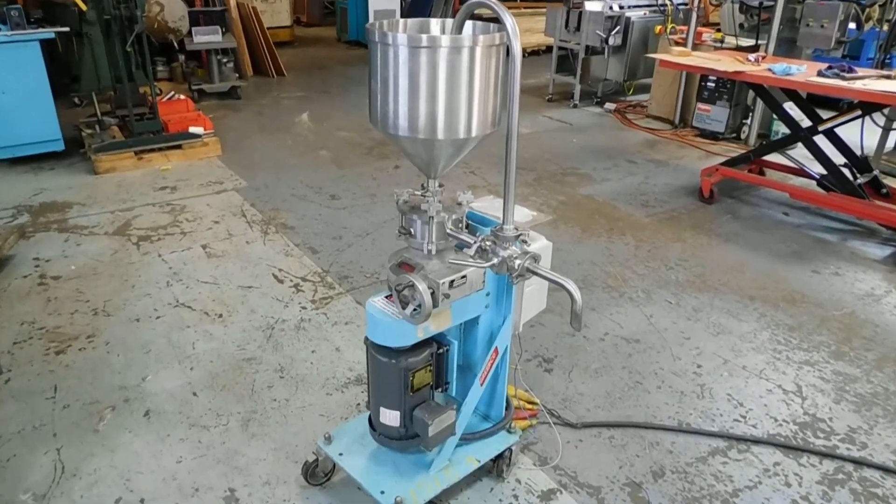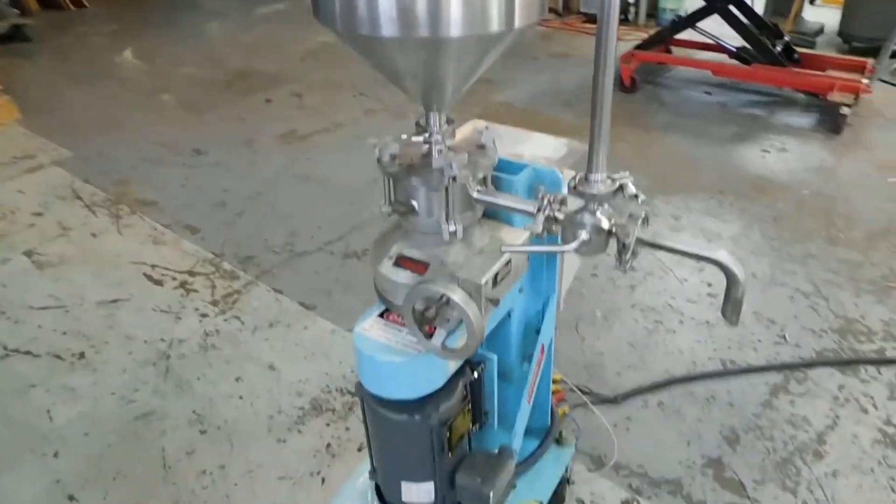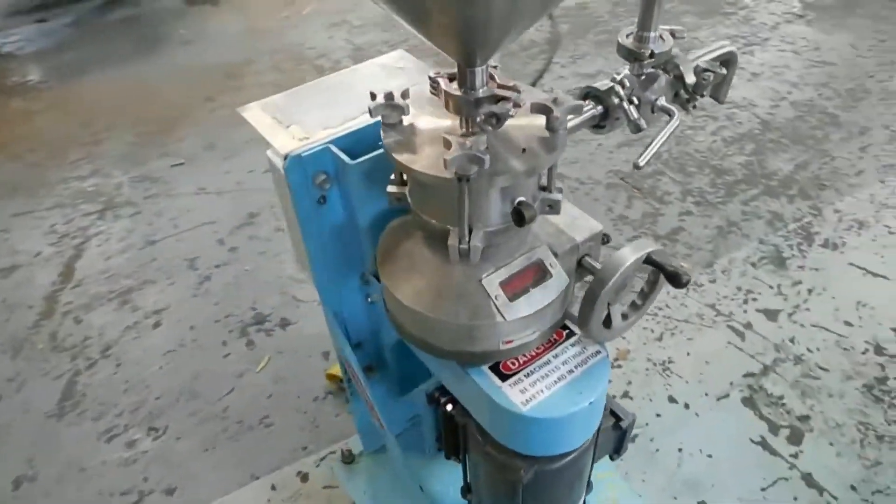We're demonstrating for you today. This is a Greerco inline colloid mill — very popular, been around in cosmetics, pharmaceuticals, and food industries for many years.